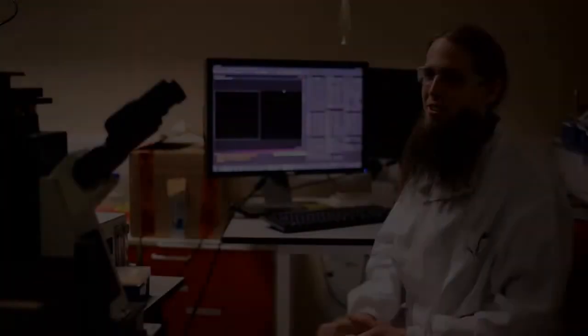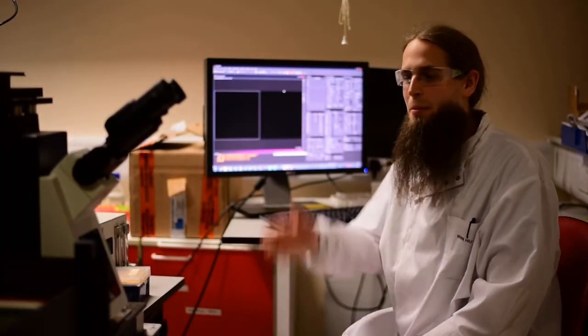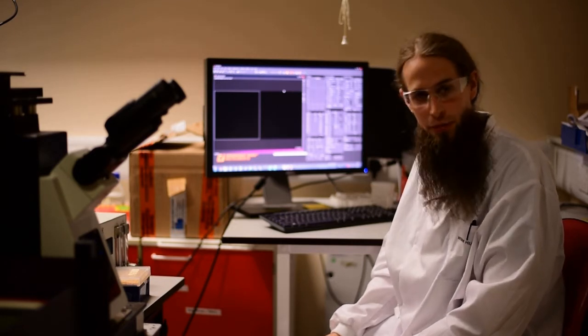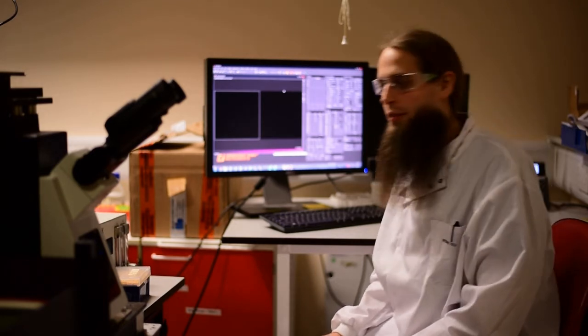Okay cool, but what does that look like in real life? Well, let me show you. So now I have some samples in the microscope, cells labeled with antibodies specifically against two different proteins. So let's have a look how that looks.